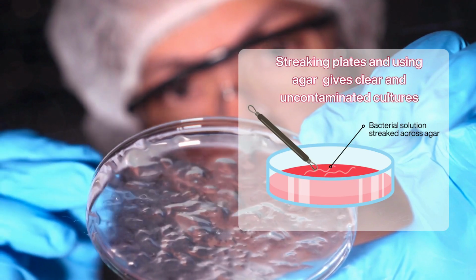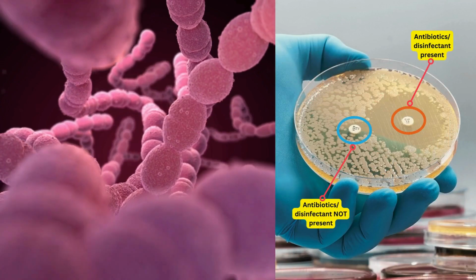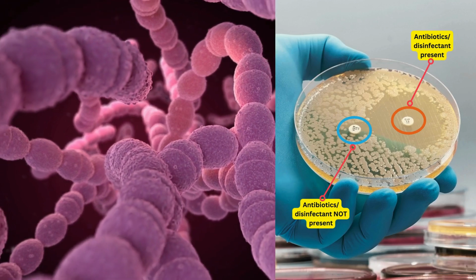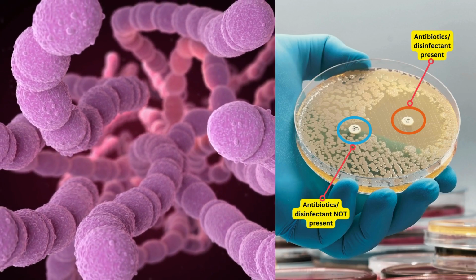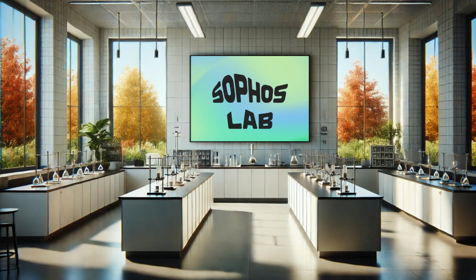Now, we're moving forward to an experiment that extends this knowledge. Today, we'll be testing the effects of antibiotics and disinfectants on these cultured bacteria. This practical will allow us to observe firsthand how these agents can inhibit bacterial growth and gain a better understanding of how they work to keep us healthy and safe. We're almost ready to dive into the details of our practical. But first, let's explore why this experiment is both exciting and valuable.